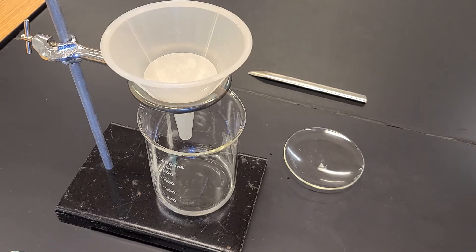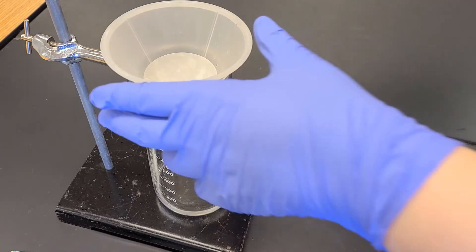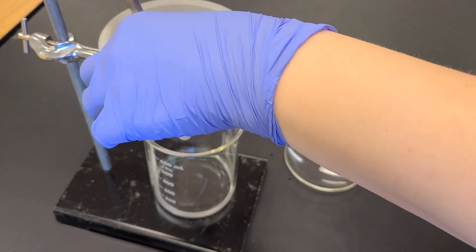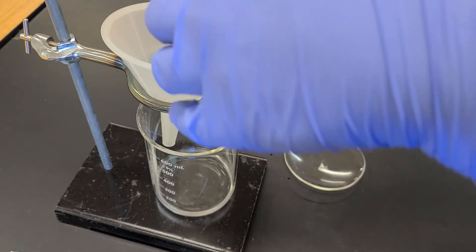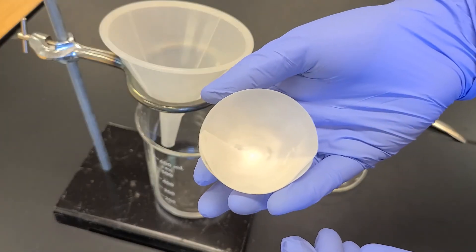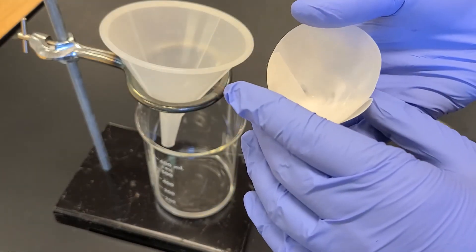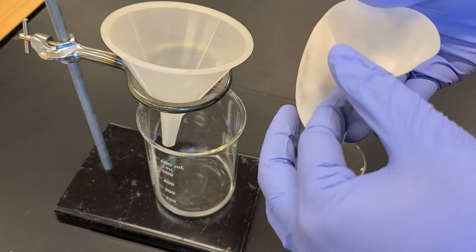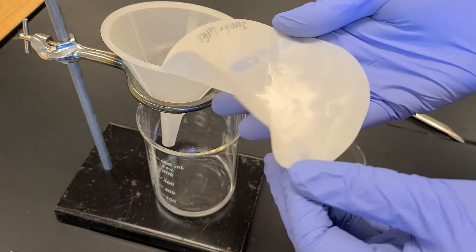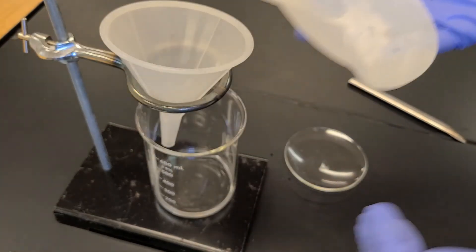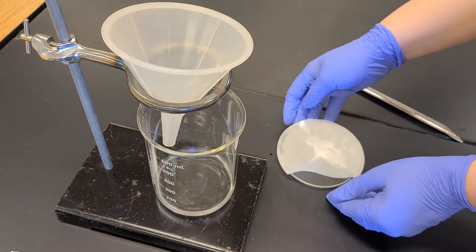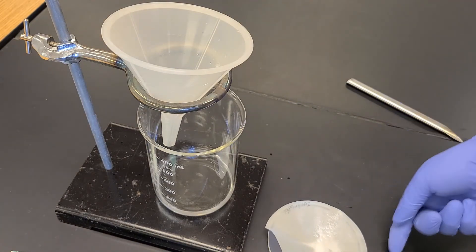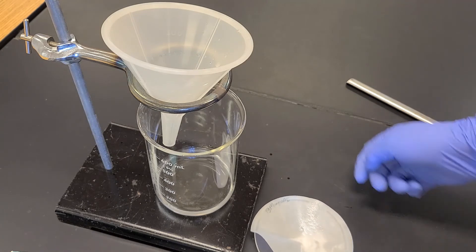All of that has run through. I'm just going to use a little metal spatula to help me separate the wet filter paper from the sides of the funnel, and I'm going to carefully unfold this and lay it flat on this watch glass. This is just a surface for me to place the sample on.